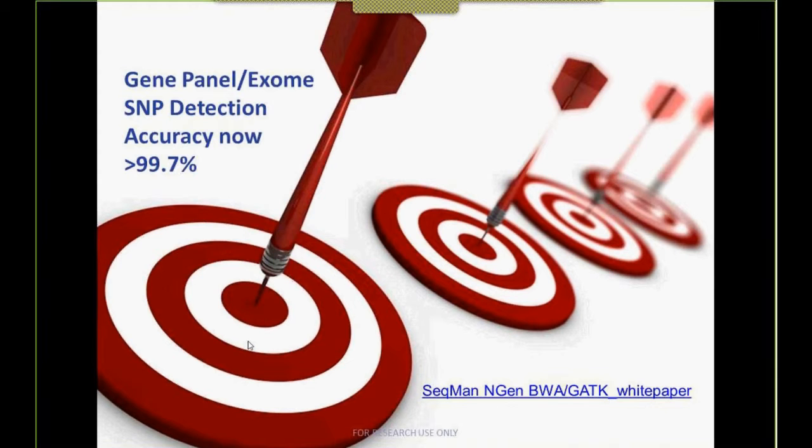And then really in the last 2 years, the focus has shifted to, let's be the most accurate aligner and SNP caller that's available. So for a little over 2 years now, we shifted that focus. A big part of the reason for that is that a highly validated data set was made available through the NIST at the NIH, from the Genome in a Bottle Consortium.